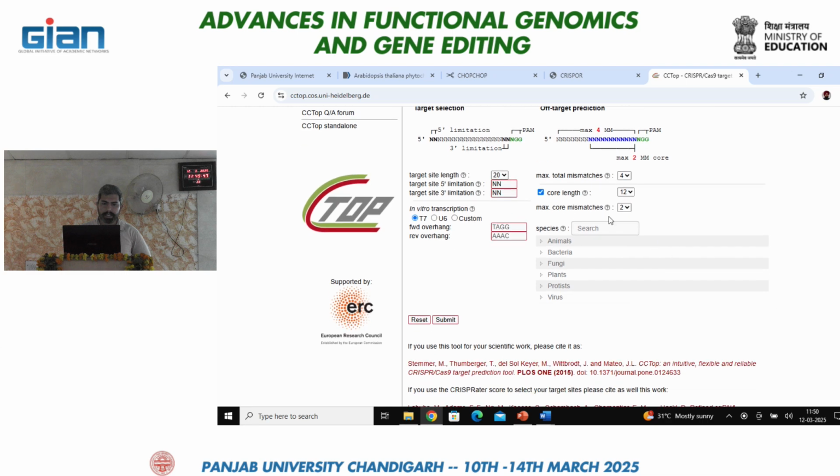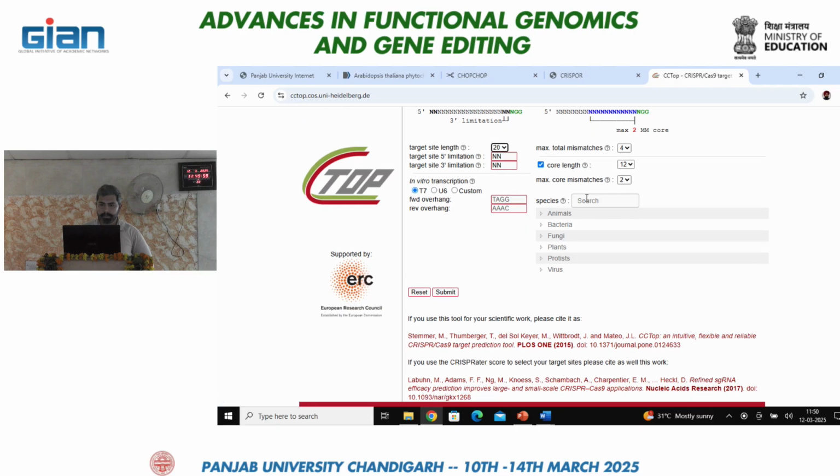After selecting that you can also tweak what length target site you want, and we have set it to the default, that is 20. And here in this box you can directly search or find your genome.